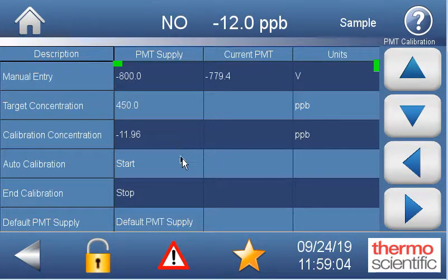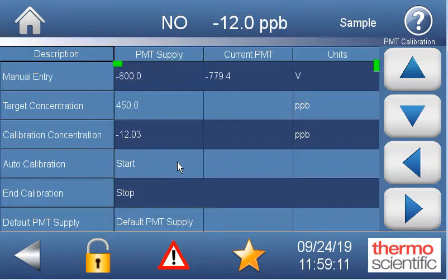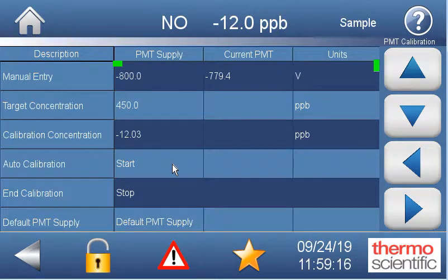That may fail — occasionally it does. There's also not a lot of status that tells you what's going on, but this button will remain yellow while it's running the calibration. If you leave this screen at any time, it's going to abort that calibration. So just hit start and let it run through.